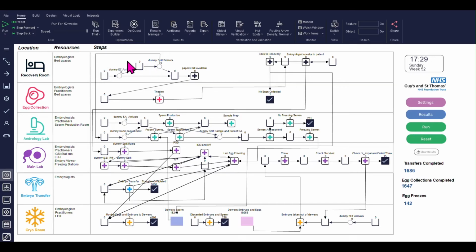Alongside the IVF processes where we have insemination or egg freezing, we have a different pathway that is set up, and it's parallel to the other one, is what we call frozen embryo transfers. And this is where the process is. It starts with taking embryos out of dewars and then thawing them, checking the survival, and checking re-expansion. At the end, they will go to embryo transfer.